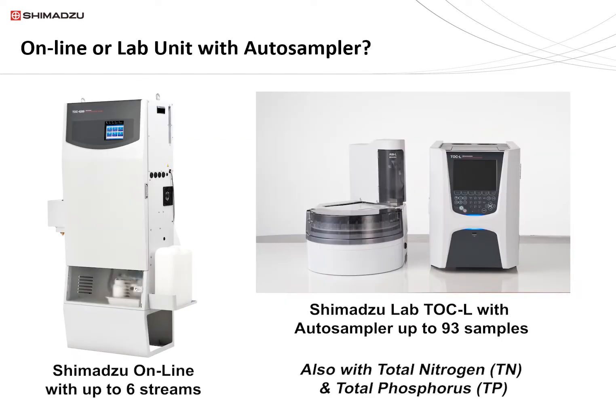Do you need an online unit or a laboratory unit? So the question is, do you want to bring the instrument to the sample or the sample to the instrument? The online units can sample up to 6 streams, while laboratory units can hold up to 93 sample vials. Online modules can sample every 3 to 4 minutes for optimization of chemical use, which will be discussed later. And some models can provide nutrient analysis for total nitrogen, TN, and total phosphorus, TP, as well as TOC.